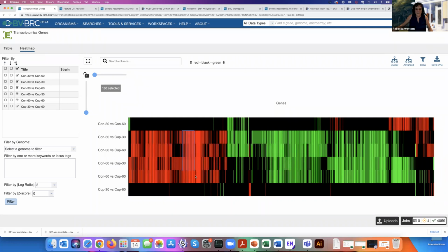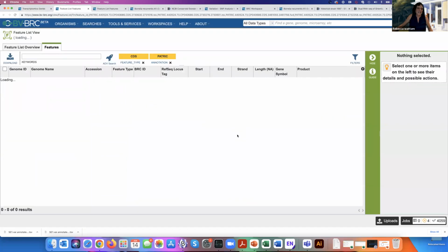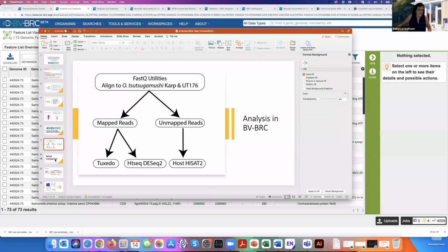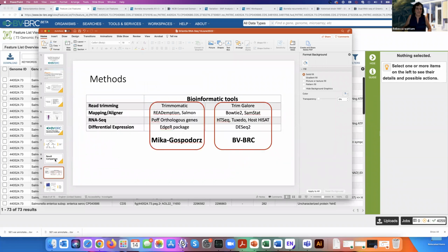And then once again, you could grab those and then show me those genes. And so you can see that kind of data and it'll load it. I mainly wanted to show you that heat map view of things when there's more there so that you can compare it. So it's a quick end because I know we're late.